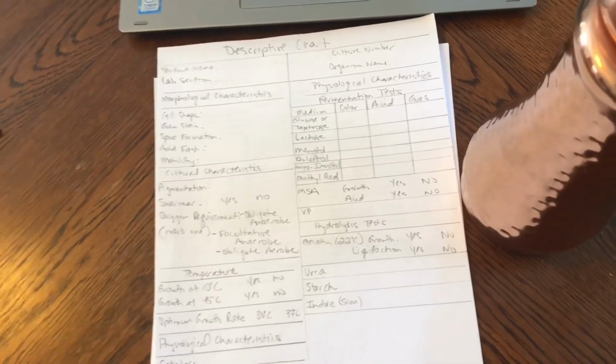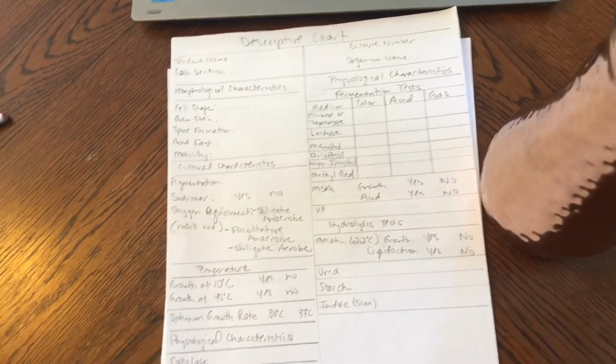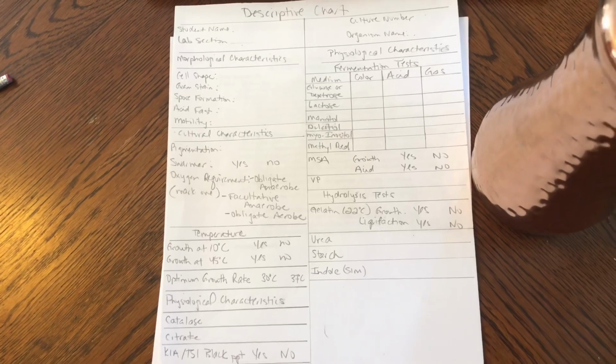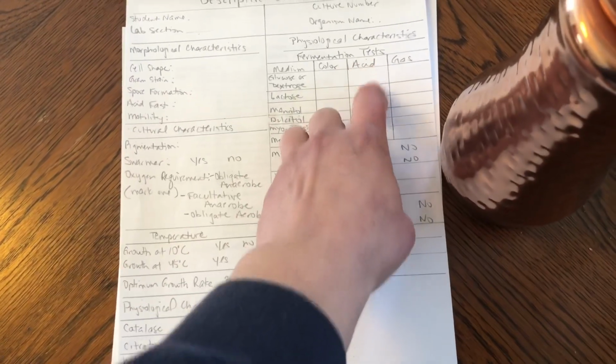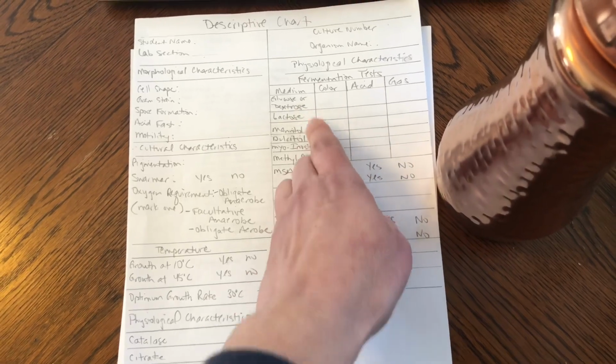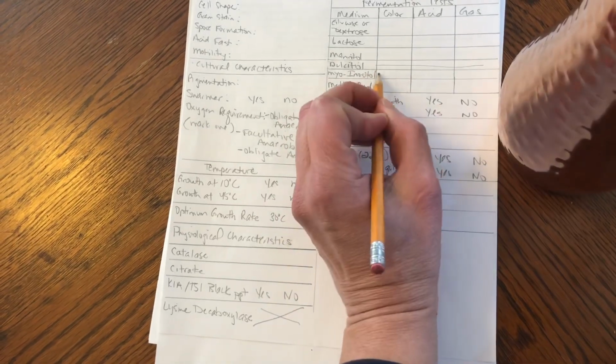What you're looking at are the test results here on fermentation tests. I would follow along, by the way, with your own descriptive chart. If you've tested, and I'm only looking at acid here, acid for all fermentation tests, that includes the glucose, lactose, mannitol. We didn't do the dulcitol or the myo-inositol, and I think I already had you cross these out, so you can cross those out.